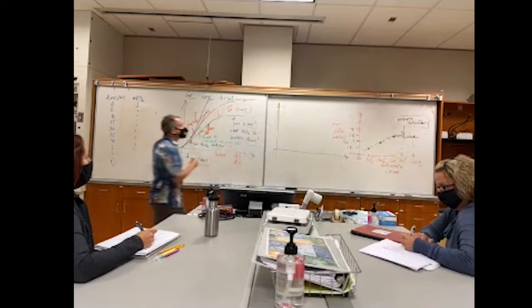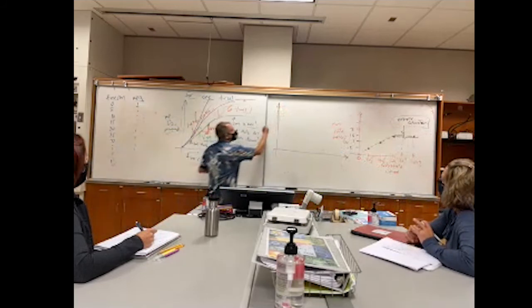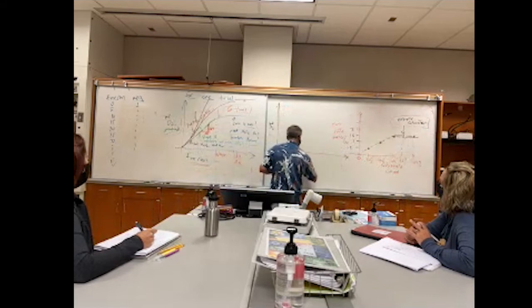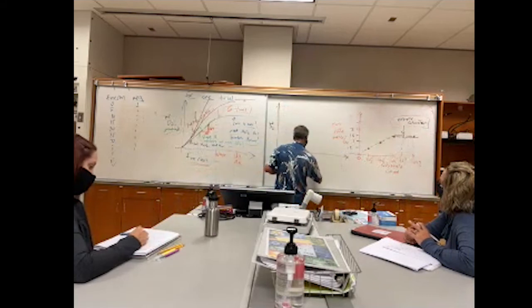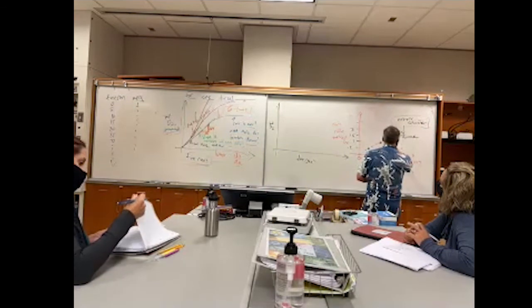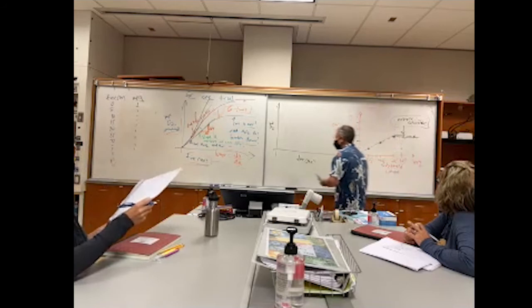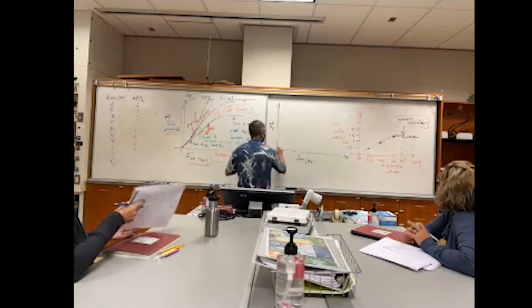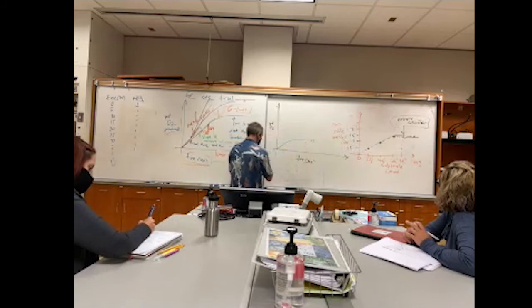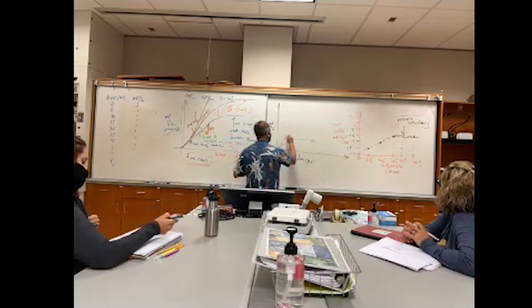let's go back to this kind of a graph of mils of oxygen per second. Now what I drew here would look something like this. There's trial 1. And then trial 2, it's steeper.